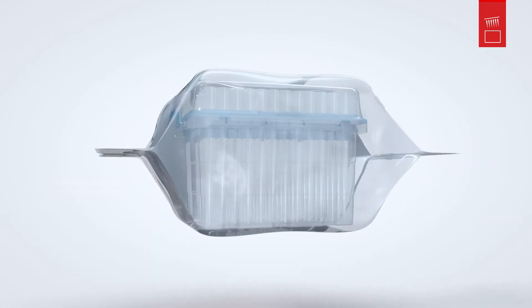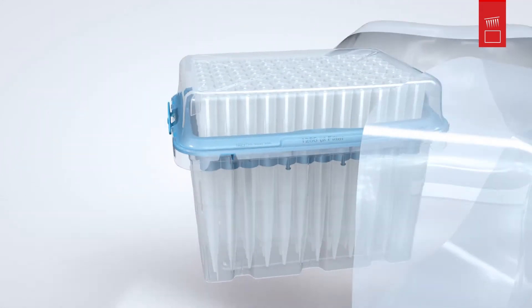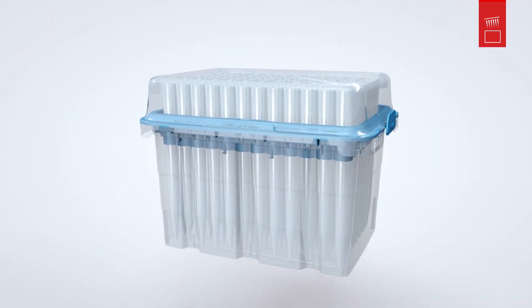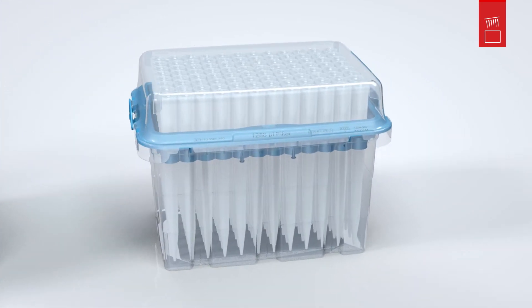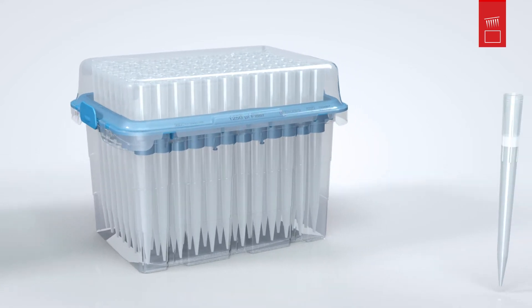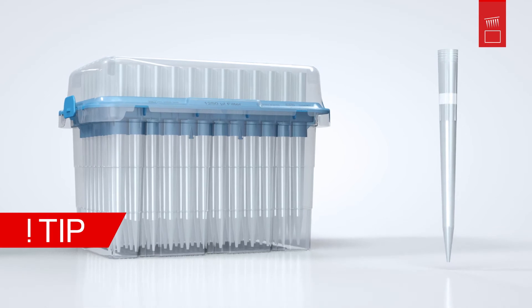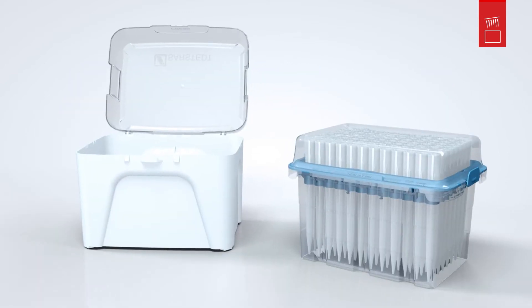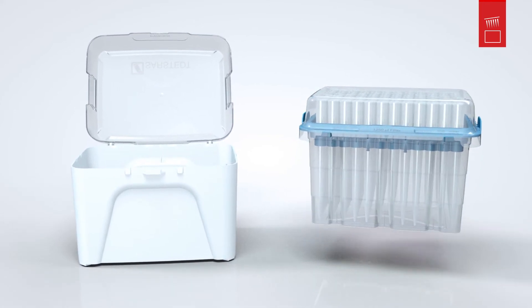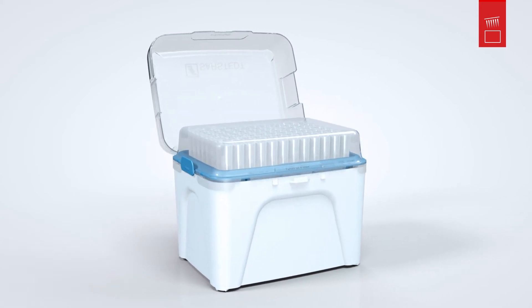The notches make the special packaging particularly easy to open. The tips are provided with all-around protection in the single refill until they are inserted in the box. Did you know that you can now also refill filter tips ecologically and securely using the single refill? To do this, you can simply hold the single refill by the lid and place it conveniently in the box in a single move.